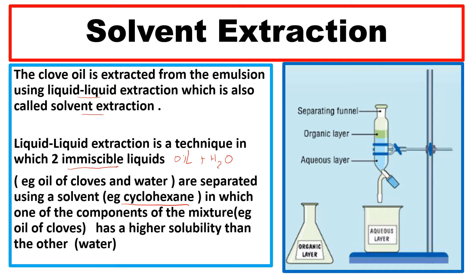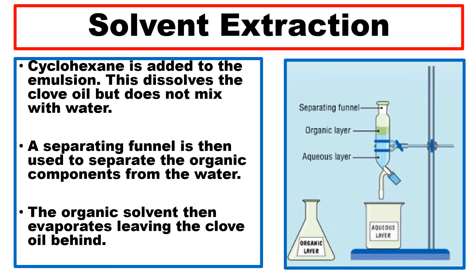In the separating funnel, the organic layer — cyclohexane — sits on top, and the aqueous layer — water — is on the bottom. Cyclohexane is added to the emulsion; it dissolves only the clove oil but does not mix with the water. A separating funnel is used to separate the organic components from the water, and the organic solvent then evaporates leaving the oil behind.